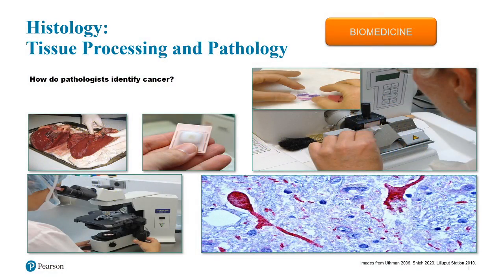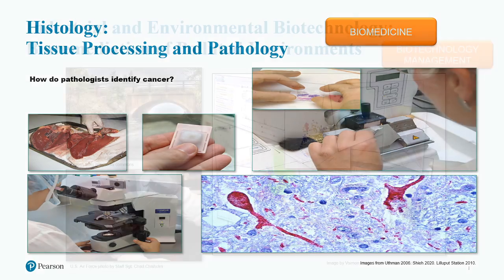Histology. How do pathologists determine whether someone has cancer, and specifically what form of cancer it is? In this practical, students dissect a tissue sample and expose it to the chemicals for tissue processing. You end up with a wax-covered sample that can be sliced thinly using a microtome and exposed to dyes to visualize the cell under the microscope, just like a pathologist does in their practice.